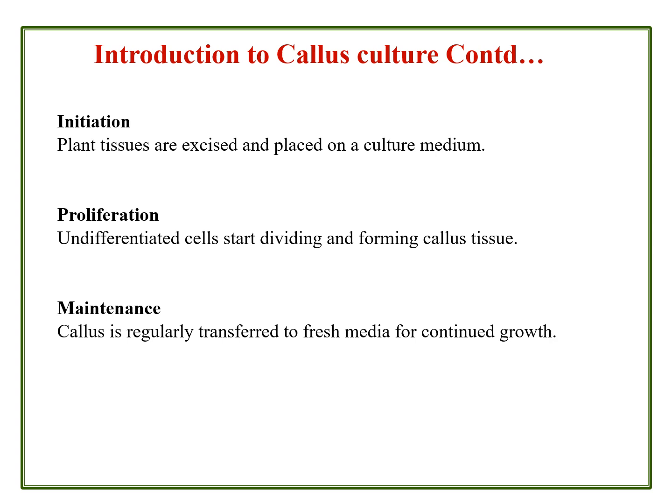and the temperature is 25 degrees centigrade plus or minus 2 degrees centigrade, and the pH in the plant tissue culture medium should be maintained, because here callus culture establishment and initiation happen only through the maintenance of the cultural conditions, especially the buffering capacity and pH of the medium, which play a significant role in sustaining the plant culture material on the MS medium.